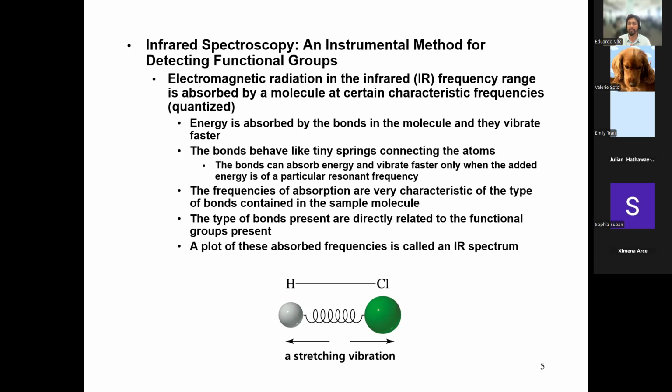Is it a heavy mass? And that mass can be considered a heavy atom. Or is it a light mass? Can you have two springs connected in parallel? So forth and so forth, right? Again, this is a lot of physics, but I'm sure you guys have played with springs inside your pens, inside your cars, maybe some toys. If you've ever played with a slinky, that is a very weak spring that you can simply go back and forth.